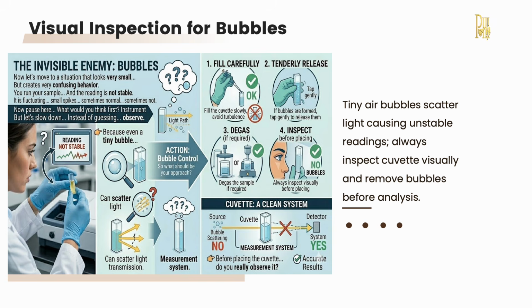So what should you do? Fill the cuvette slowly. Avoid turbulence. If bubbles are formed, tap gently to release them. Degas the sample if required. Always inspect visually before placing, because in UV analysis, what you see is as important as what you measure.